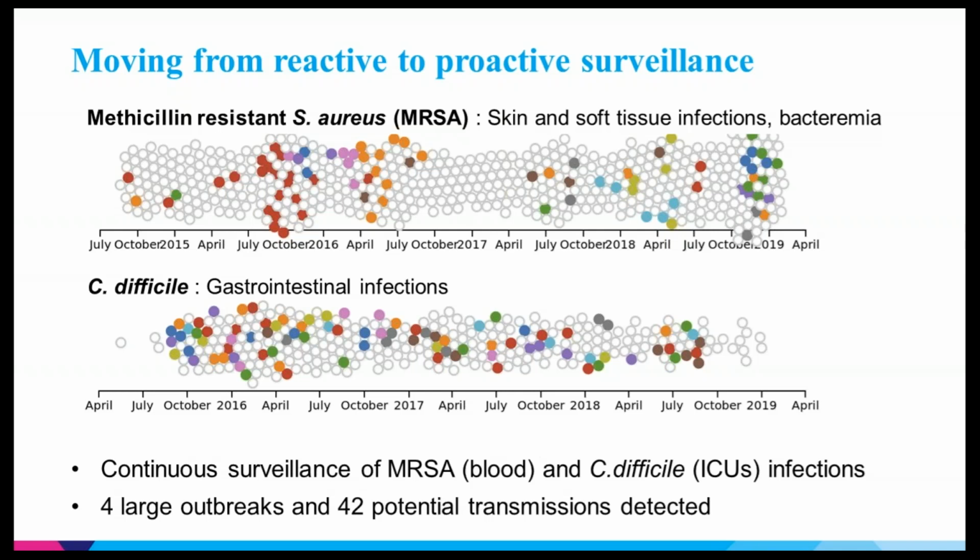And over the years, we've sequenced more than 1,000 genomes. We're getting a really good closure rate on those. I'd say it's in the order of 85% of the C. diff genomes that we sequence and assemble are completely closed, and it's in the 90s to upper 90s percentage for MRSA. So we then do complete genome comparative analysis, and looking at genetic similarity between isolates, we identified 4 large potential outbreaks and about 42 potential patient-to-patient or smaller scale transmission events.